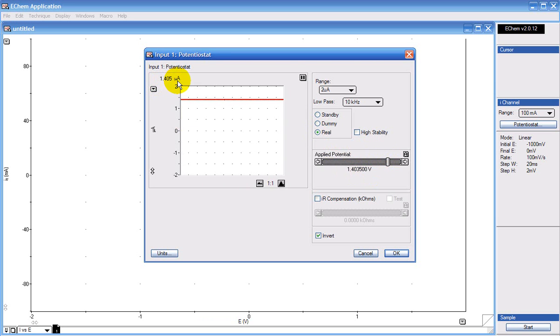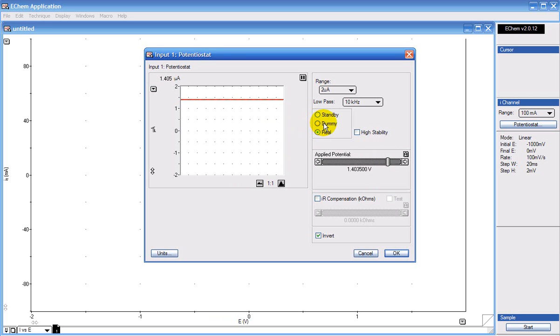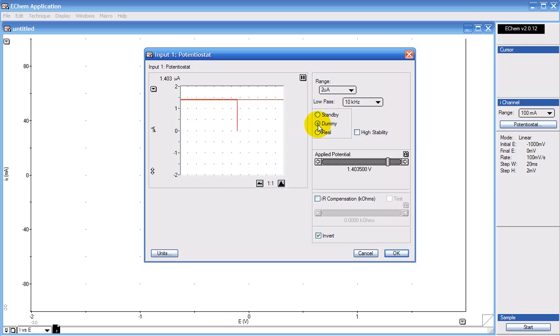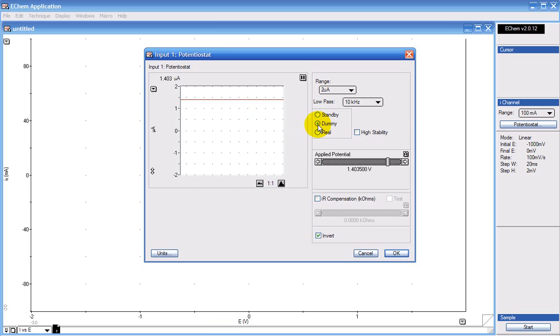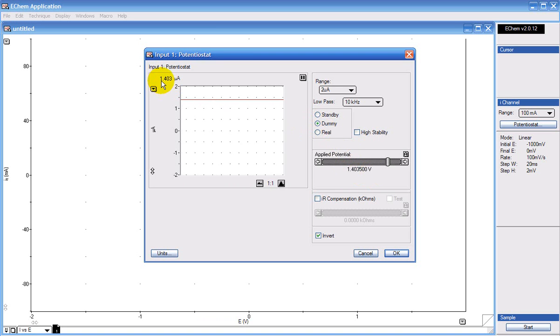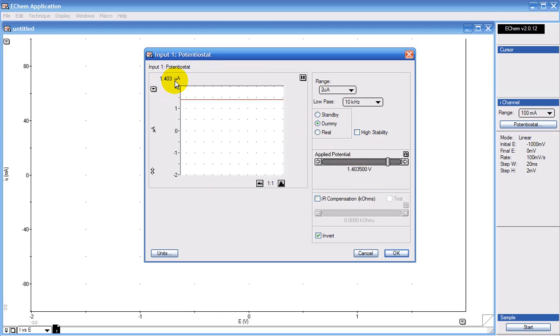You can also do this test without the electrode's cable by clicking the dummy cell. The dummy cell is a 1Mohm resistor which is inside the potentiostat. And you can see I'm applying 1.4 volts and still recording 1.4 microamps. So I know that my potentiostat is working correctly.